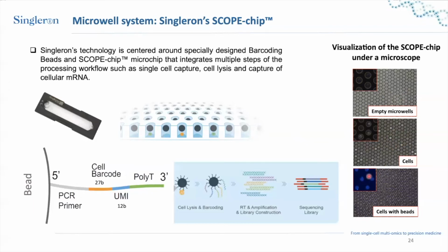And then we load the wells with the beads. For the beads, it's not important. Based on the engineering, each well can contain only one bead. That's pure math. The width of our well is 40 microns, and the beads are 30. So only one bead can fit in.